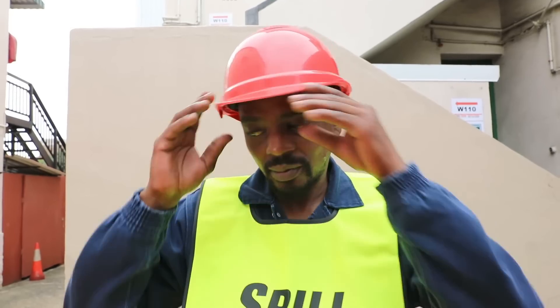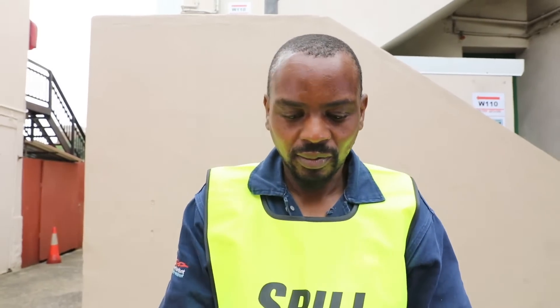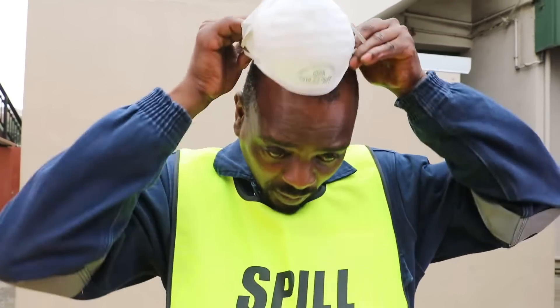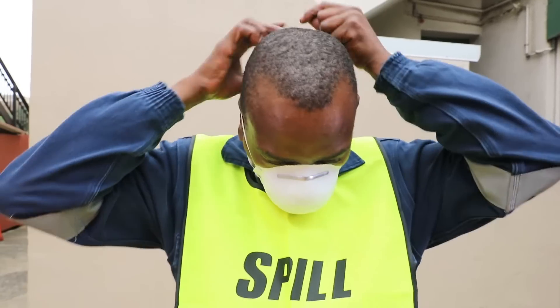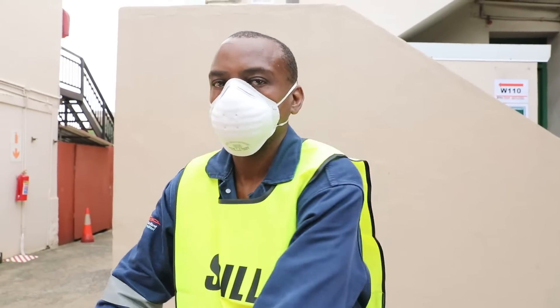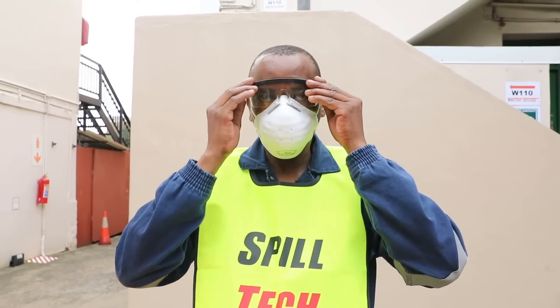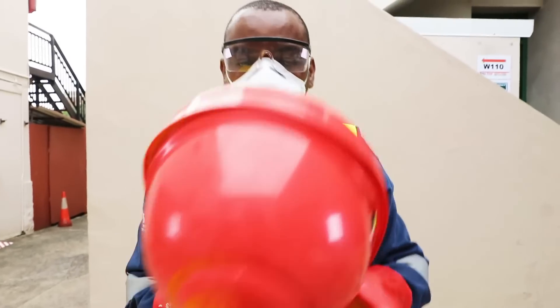One: remove your helmet. It is important to put on the mask first before you apply other items which may get in the way. Hold both straps together, slip them back onto the back of your head and then pull the mask forward onto your face to cover your nose. Two: put on your safety glasses or goggles. Three: put on your gloves and replace your helmet.